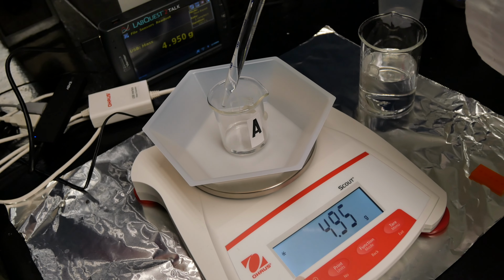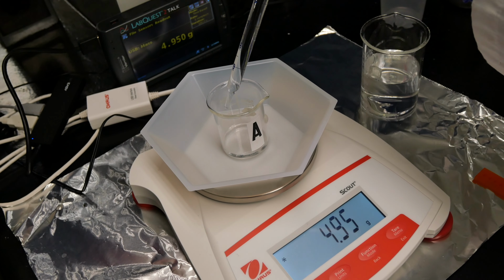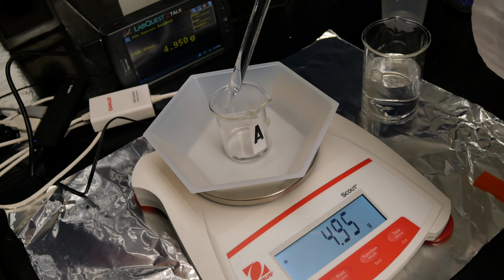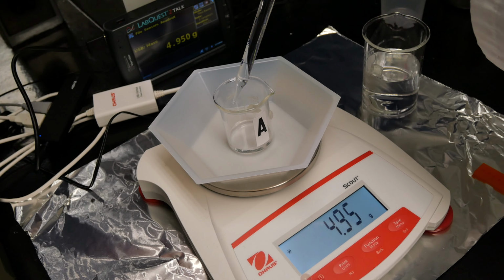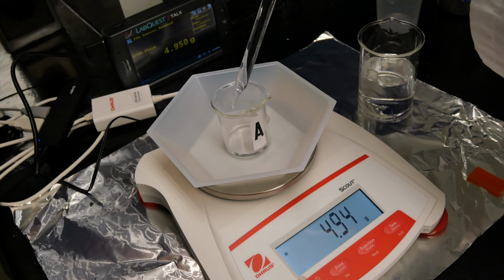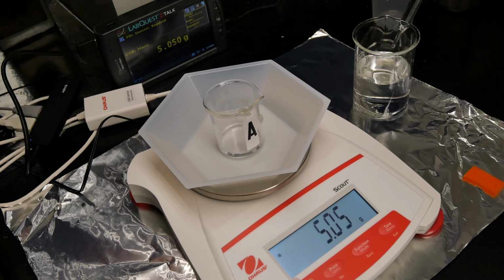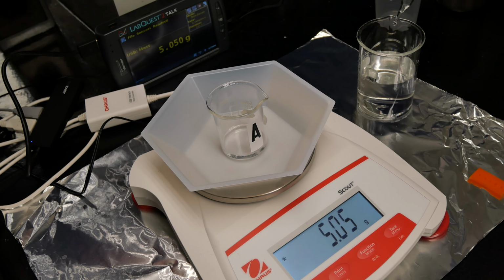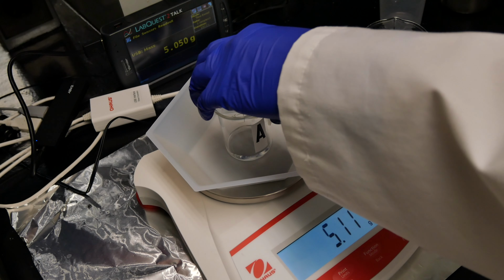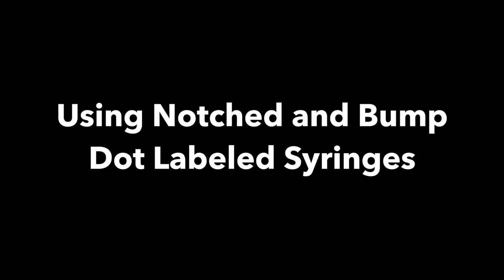Mass 4.910 grams. Getting close. Mass 4.950 grams. I add a little bit more. Mass 5.020 grams. Mass 5.050 grams. I put the leftover water back in the storage beaker using notched and bump dot labeled syringes.